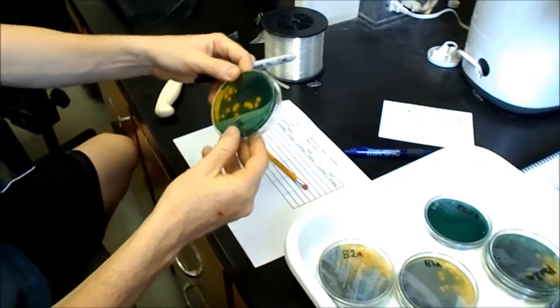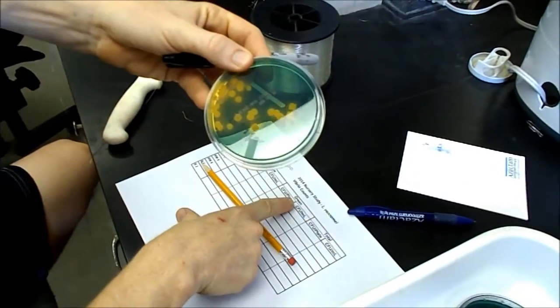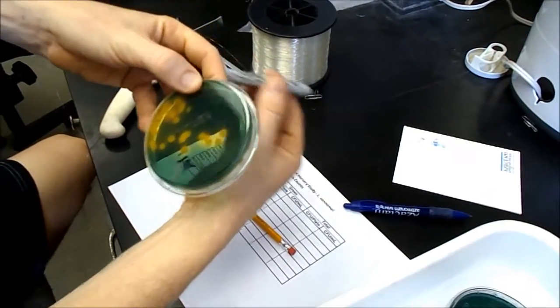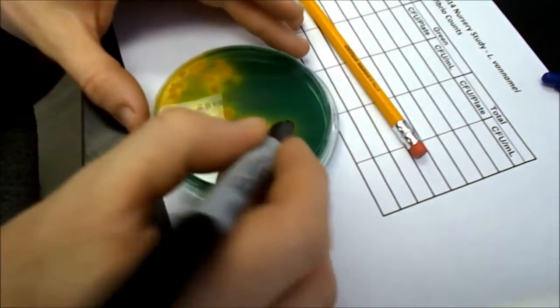Turn it upside down. And we're looking for any yellow colonies or colony forming units and green colony forming units. And as I count them, I'll mark them with a pen and marker.